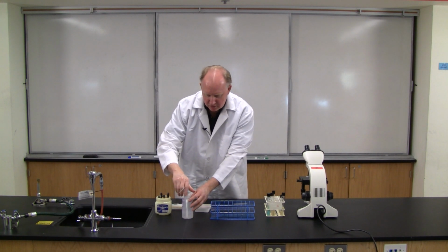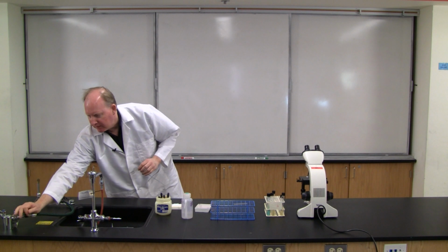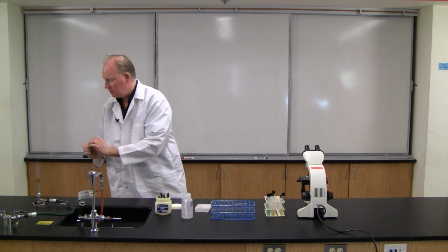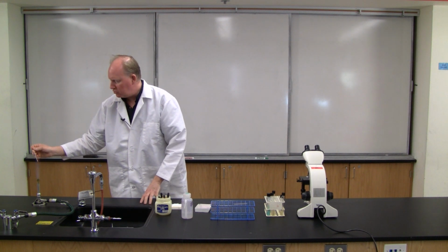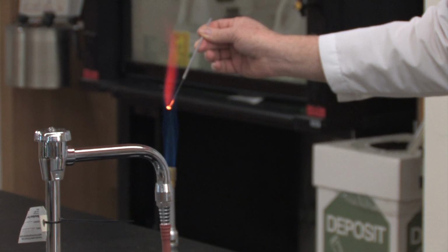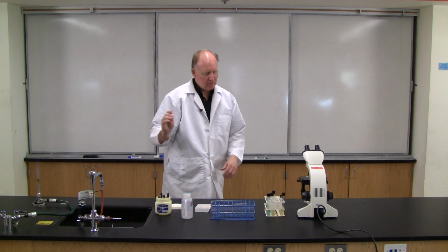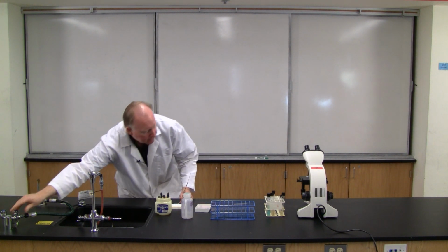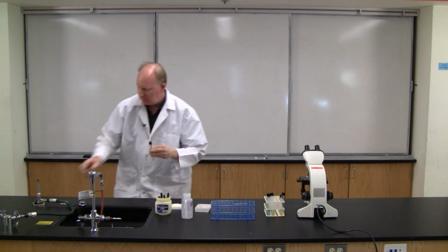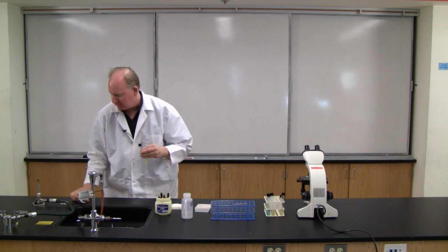And then, using sterile technique, transfer a little bit of bacteria to the drop of water. So we'll have to turn on the burner, of course, and flame our inoculating loop in the usual way. And I'm going to put a little bit of E. coli on the slide. E. coli is actually a motile bacterium. Turn that off a little too soon there.